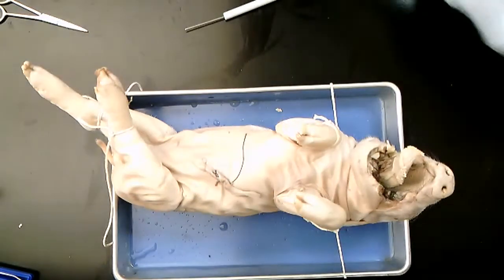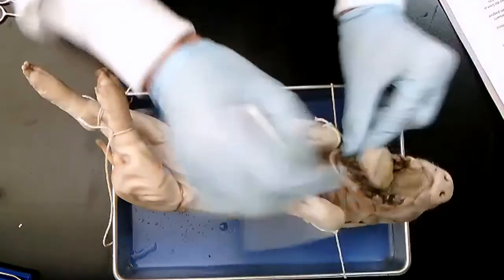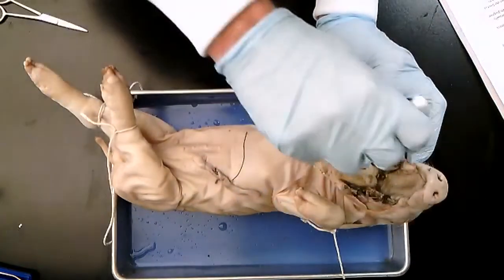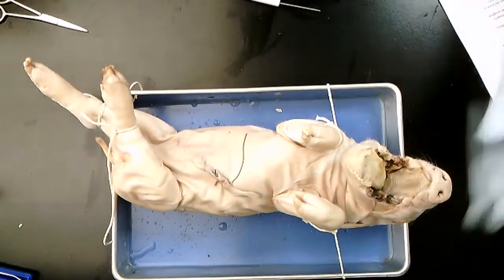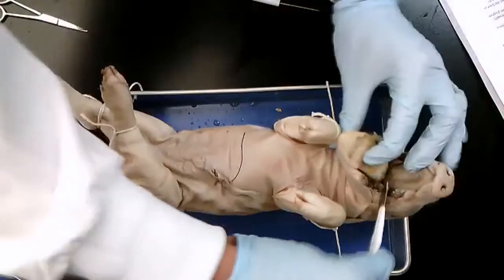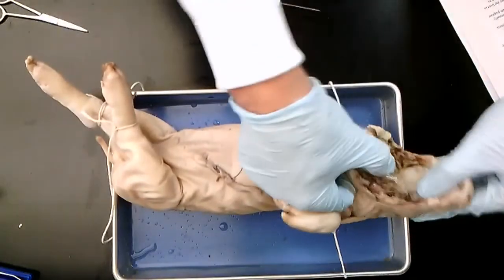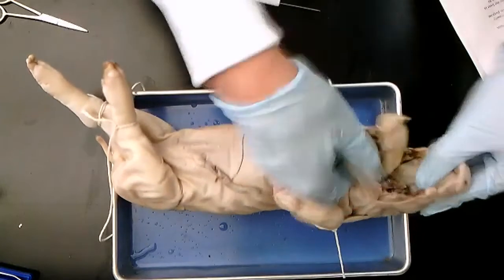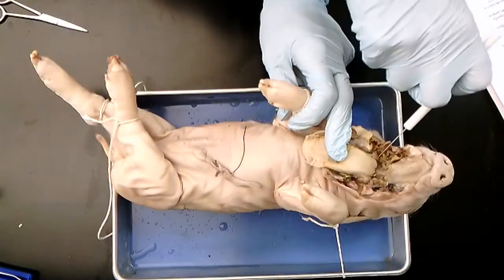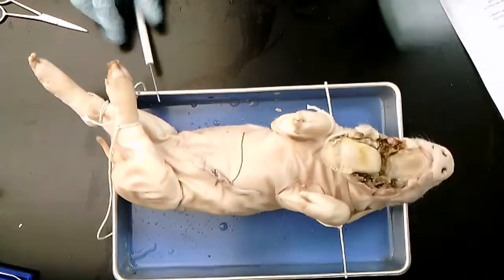The handout that I'm going to put online goes through each step of this. I don't think you're going to be able to see the epiglottis very well here, but to see that, you're going to have to make sure that you've opened the mouth quite wide. And please ask questions as we go. And there's also diagrams in the document that I'm going to put online.